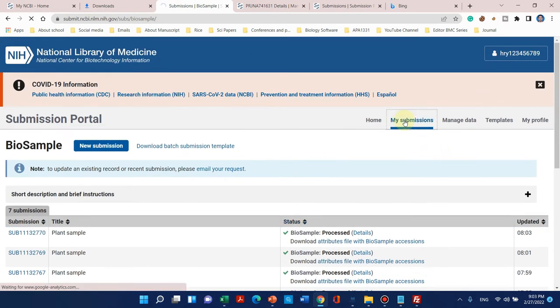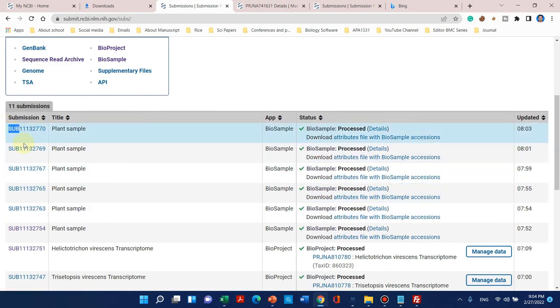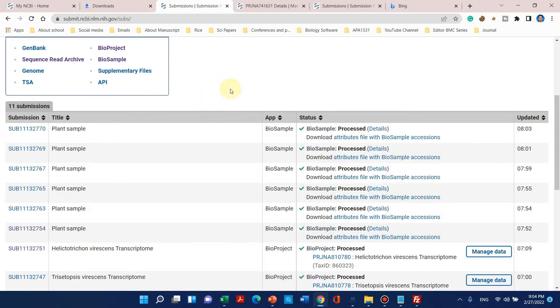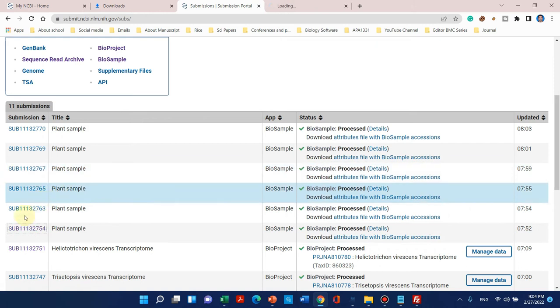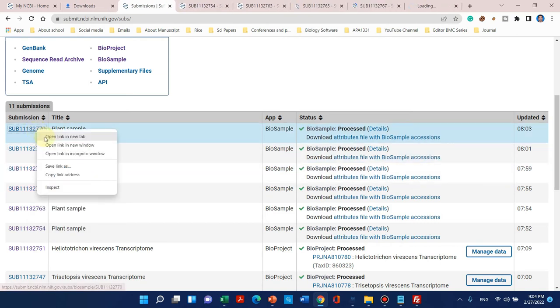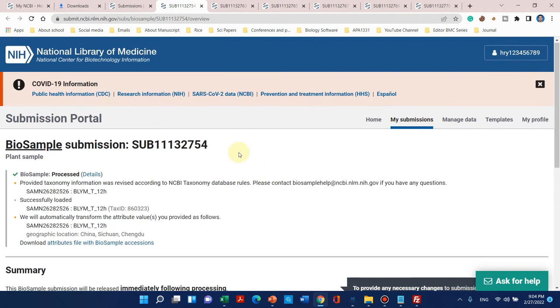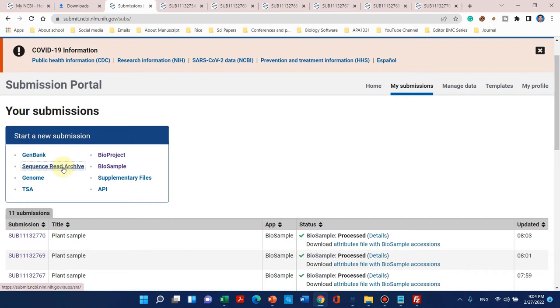Now we go back to main submissions. The third step was BioProject, the fourth was BioSample, and now we will move to the Sequence Read Archive — our last step to submit RNA-seq data. Before that, we can copy all the submission IDs and open them in new tabs because they will be needed in the next steps. We have six BioSample IDs. So now we can start the Sequence Read Archive.